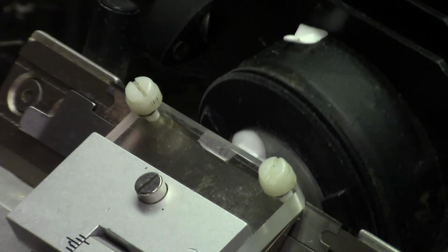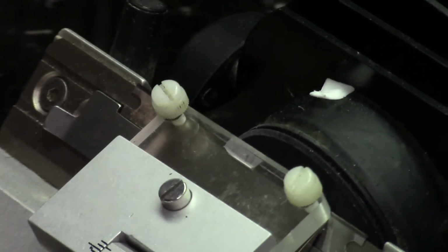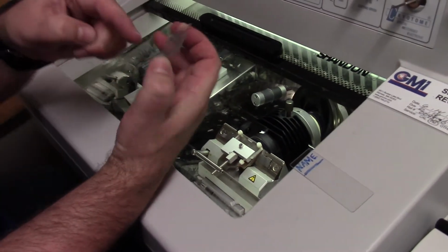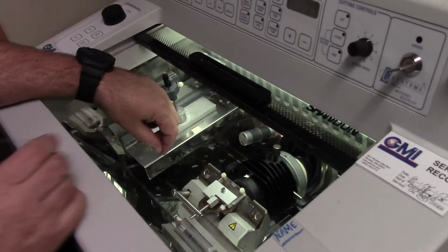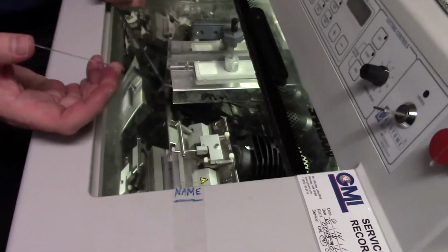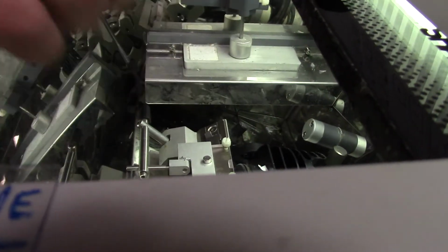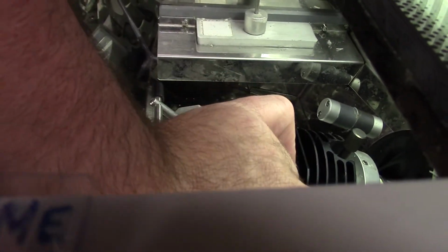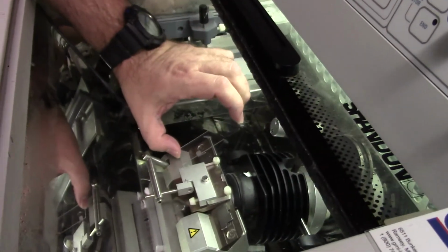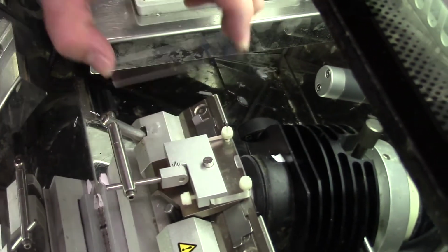Nice tissue section. So I'll take my slide, turn it upside down so that the side I've written on is the side that's going to face down, and pick up the piece of tissue. Now I have to do this relatively quickly, and my hand will probably be partially in the way. So what I'm going to do is lift the roll bar out of the way, so the roll guard will come up, and then I will press this down on the metal plate, and quickly, I'll show with my left hand. Okay, I'm going to push it down till it picks up the piece of tissue, and then lift it up again.